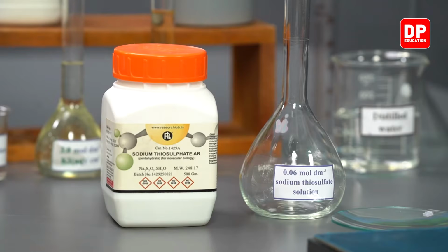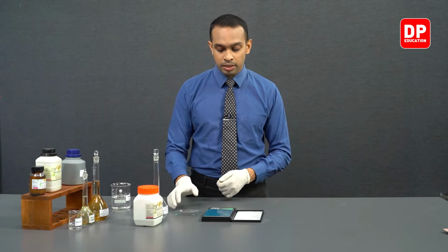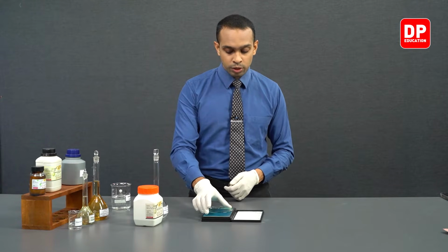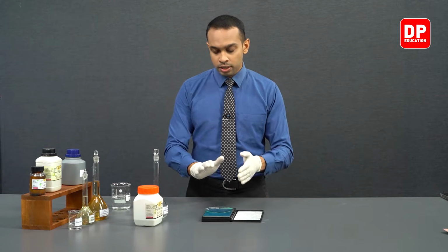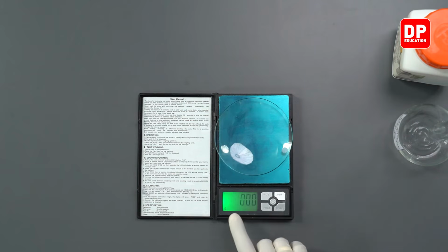So we need to measure 3.72 grams and then proceed to preparing the solution with the use of a volumetric flask. Like we did in the previous instances, we will use our digital balance here, and we will be using a watch glass as well. Let's use the tare function to get the digital balance reading to 0 after placing the watch glass on the digital balance.